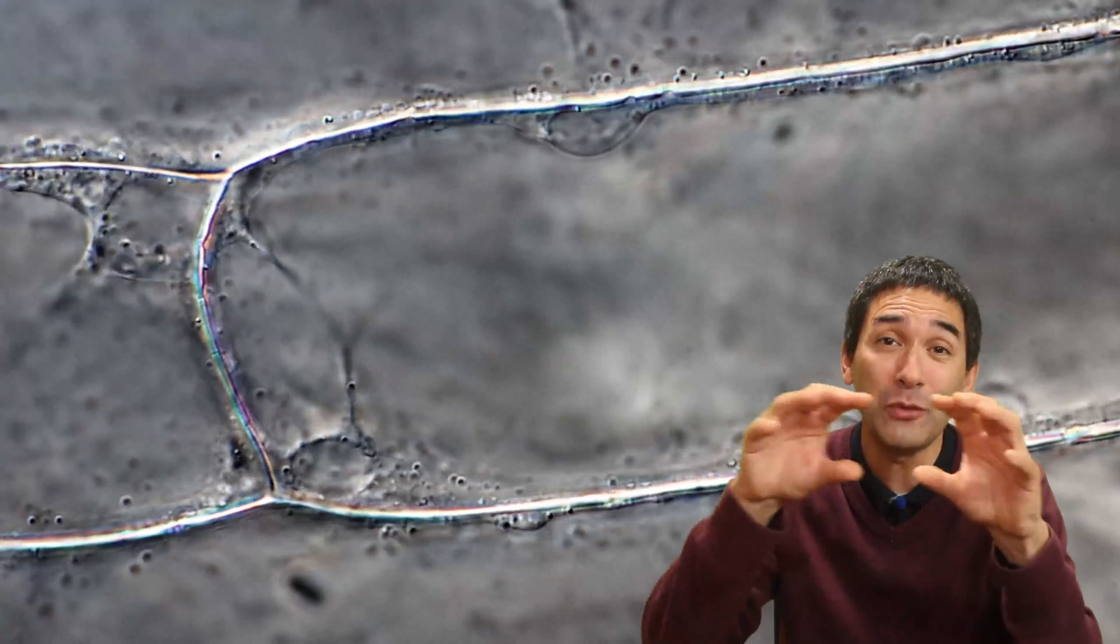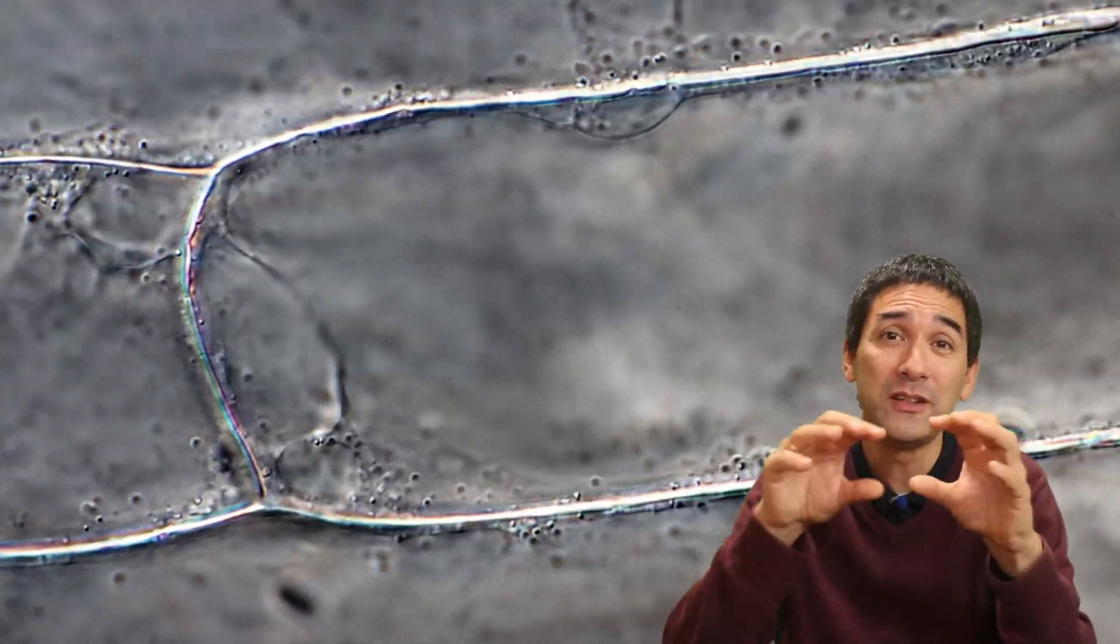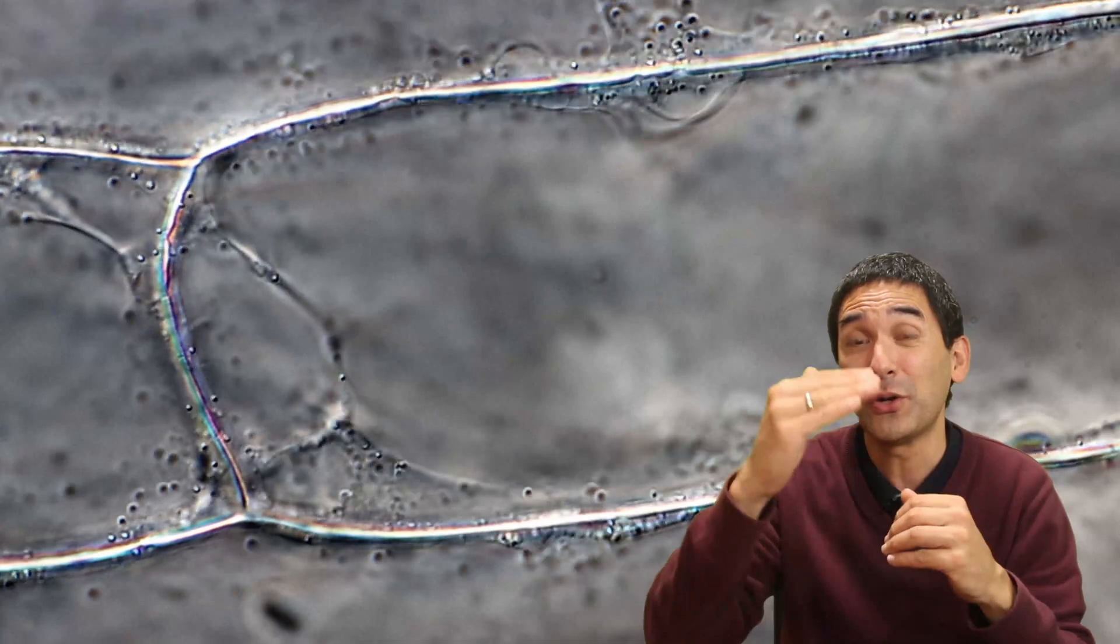You can see that their movement is not entirely random either. Here in this video clip, you can see that the central part of the cell actually does not contain so many of those vesicles because most of them are compressed to the side where you see the cell wall.